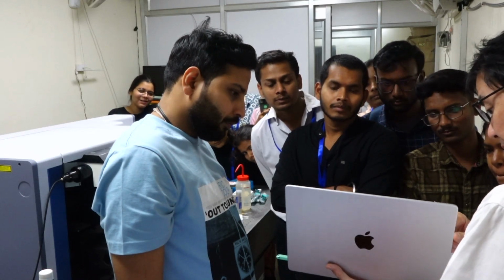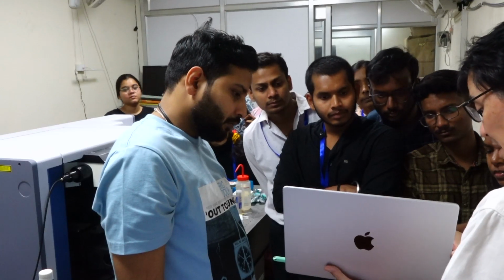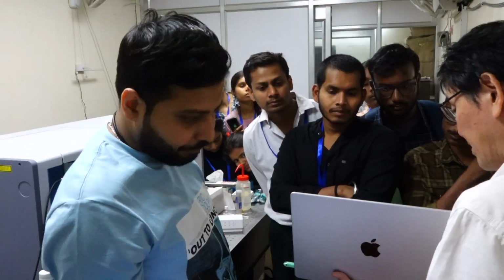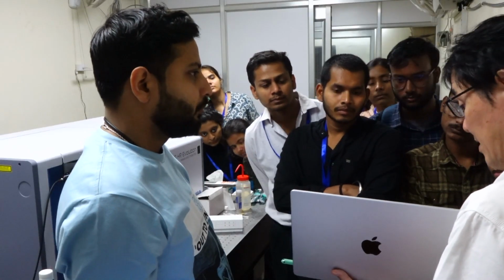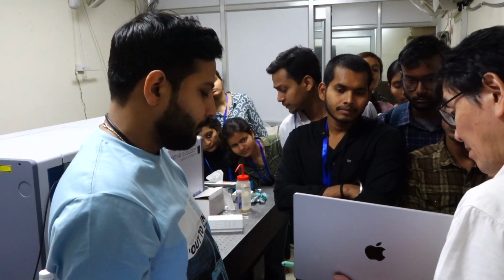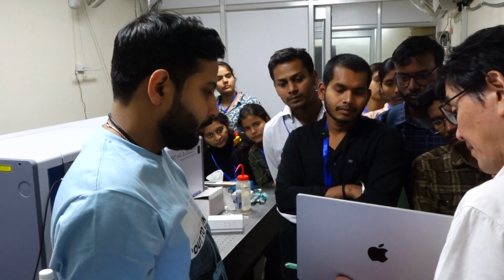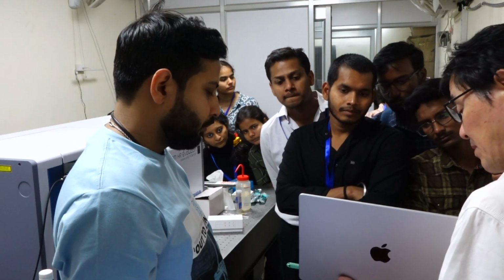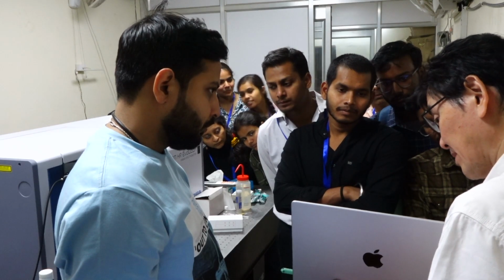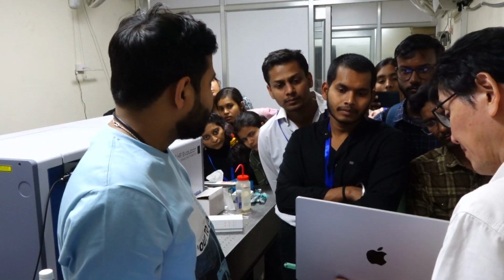Yesterday we found in the fructose spectrum that CH stretching appears below 3000, and the corresponding peak appears here below 3000. As well as this peak, we find many peaks below 1500. Blue is the sucrose spectrum. The SN ratio is a little bit not good, but we see the intensity pattern and peak positions are quite different.